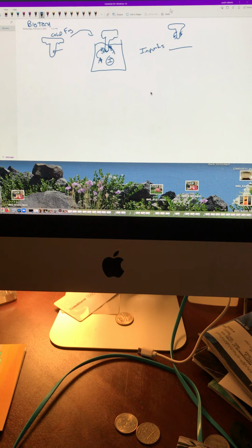No one? All right, so long story short, what are we doing? We're doing it based on when this stuff precipitates out. Different things precipitate out at different temperatures. And as long as that's true, which it is, then we can control the temperature at which you precipitate. And then the cold finger will precipitate, hopefully, what you're looking for. So we have A, it precipitates, you leave behind your impurities, and we managed to isolate A. Not only did we separate it, but we identified it. Got it? I like it. So that's what the cold finger does. That's my story. I'm sticking with it. Let's move on from there.